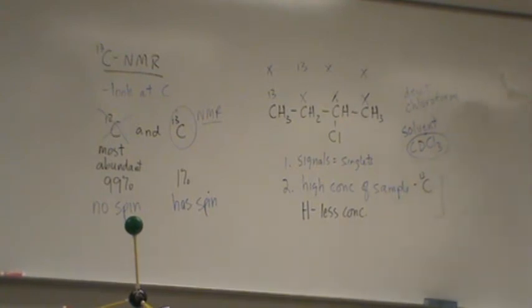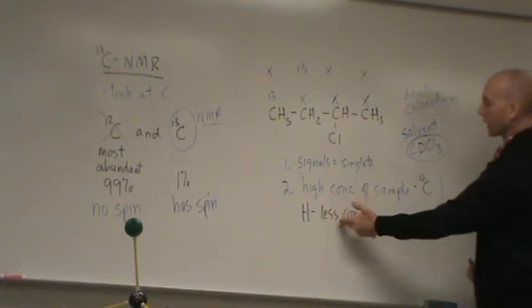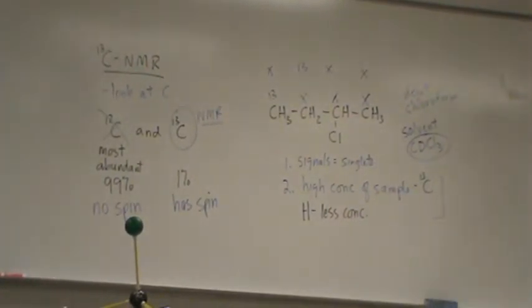That's the solvent that we dissolve our sample in, whether it's hydrogen NMR or C13 NMR.